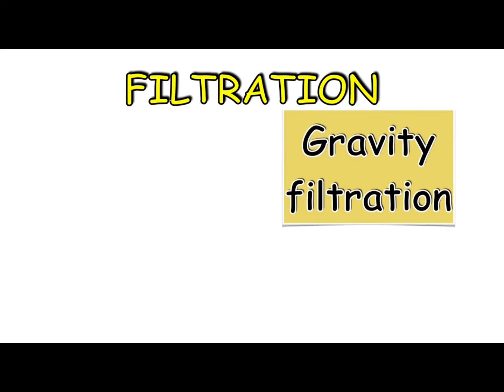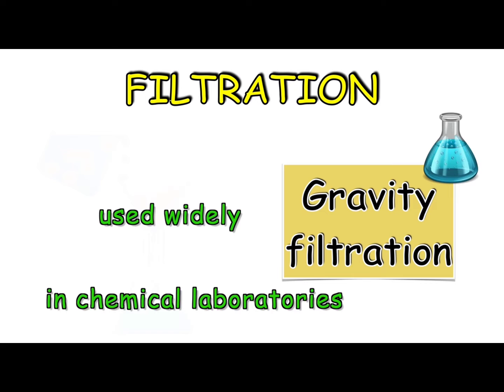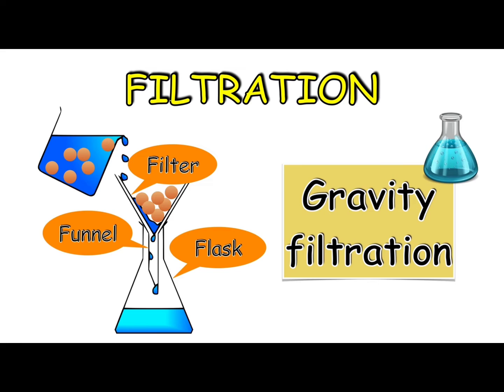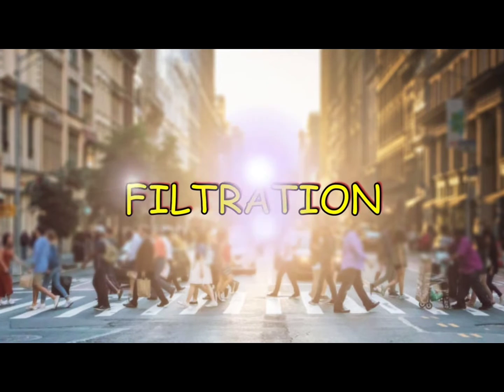Gravity filtration is the simplest form of filtration, and it is used widely in chemical laboratories. In gravity filtration, the solid is trapped by the filter and the filtrate is collected through the funnel into the flask. Always remember that filtration happens every day around the world.